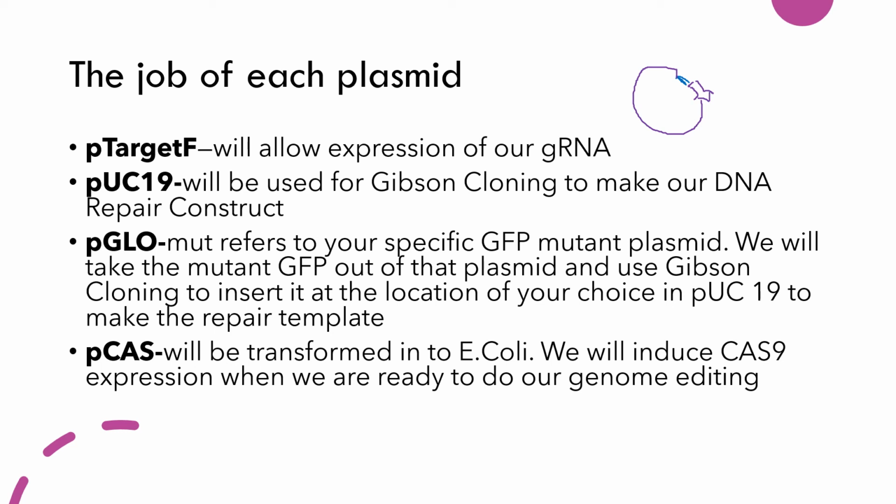So this is our little LacZ specific fragment right adjacent to where it needs to be to target. There's the complement of the PAM site in this scaffold, and that helps line up the guide RNA for cutting. We used pUC19 because it has LacZ in it.